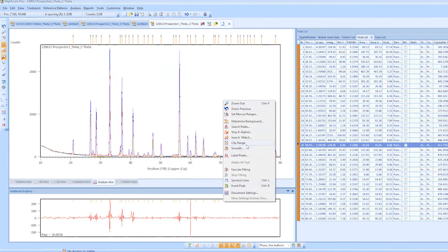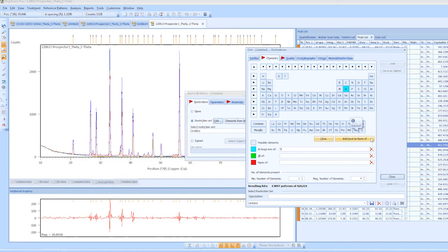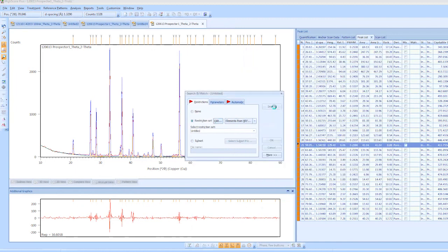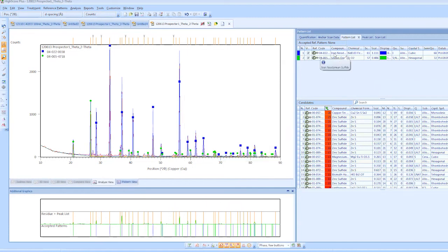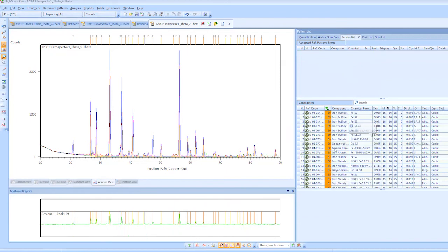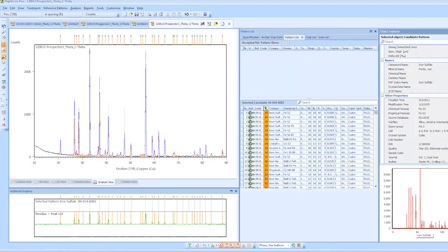And if we do our search match, edit, let's get rid of the silicon. It should come up with the same results. And you have to be careful, since you guys are all sharing this, it seems like someone's already made some changes to the defaults, because this shouldn't be doing this up here. It looks like it's automatically adding these in, so be careful. Always check your object inspector pane, because a lot of times when you look at these cards, they'll have something very odd on here.